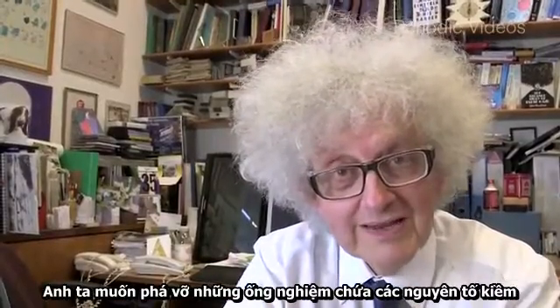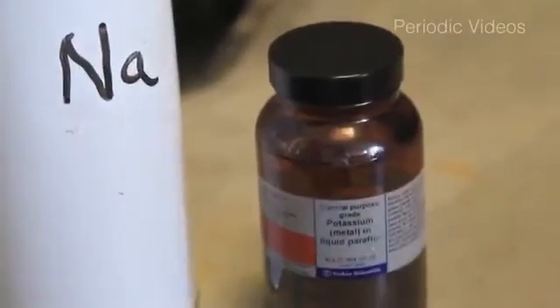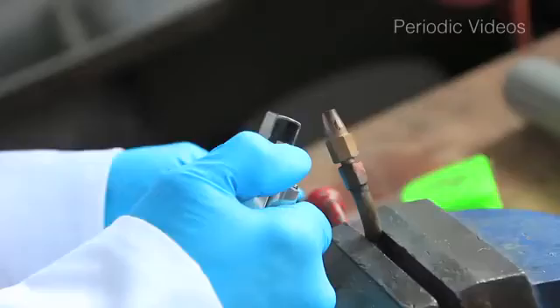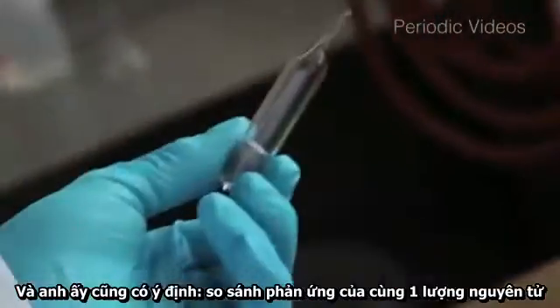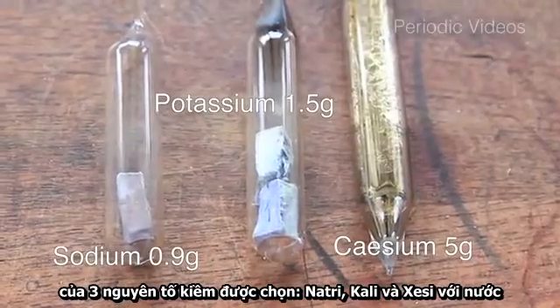He wanted to break ampoules — glass vessels containing the alkali metals — underwater, so we can watch the reaction before there is any air present. He also had the idea that we should compare the same number of atoms of the three metals he chose: sodium, potassium, and caesium.